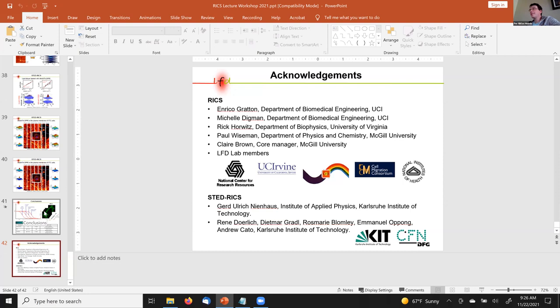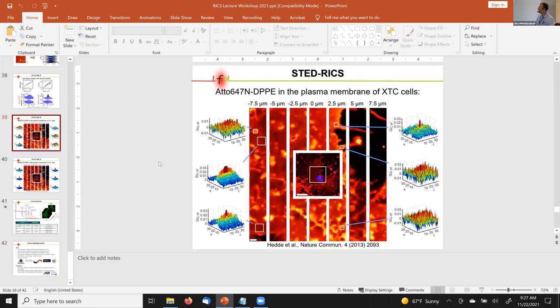If there's a question later, you can also ask. Just a very silly question, but just to put in perspective, the use of the super resolution. The experiments that you have shown are mainly for in vivo cells, because I saw that you were using ATTO and some other fluorophores. How gentle is the STED for in vivo experiments?